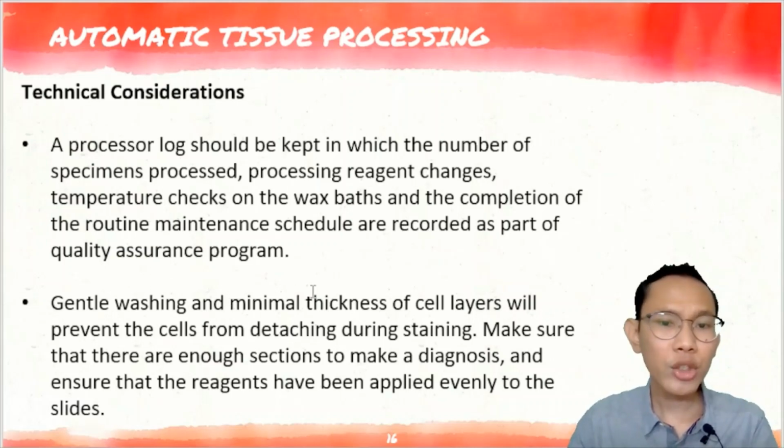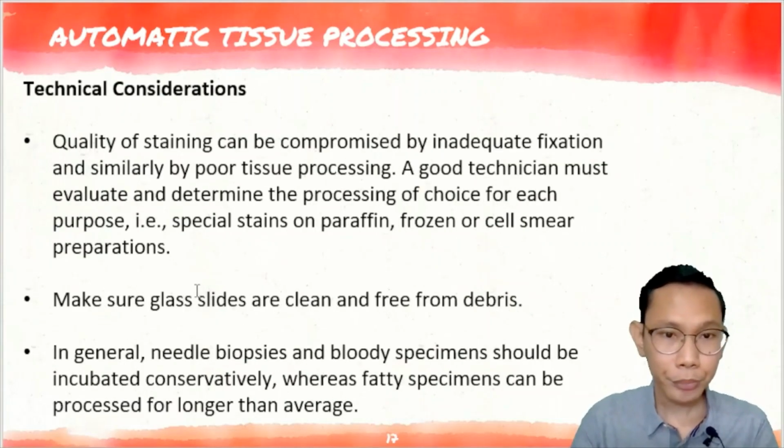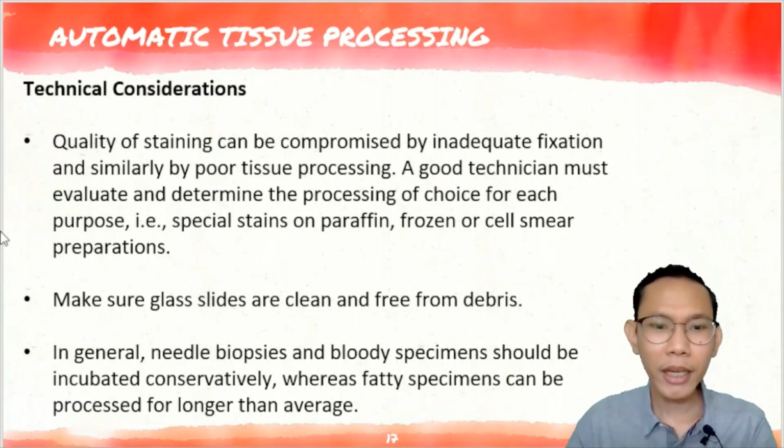Your gentle washing and minimal thickness of cell layers will prevent the cells from detaching during your staining and make sure that there are enough sections to make a diagnosis and to ensure that the reagents have been applied evenly to your slide. So this is more of the staining. So later on, we will discuss naman sa staining. Of course, again, this one also talks about your staining.